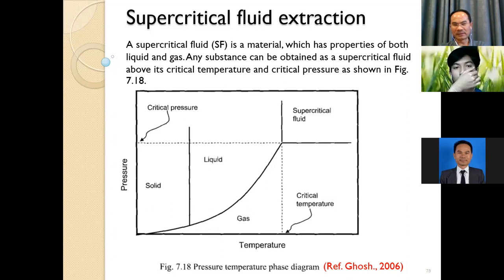And also the technique that I will talk about now is supercritical fluid extraction. This is the technique that is suitable for the bioproduct or biomolecule. First of all, what is a supercritical fluid? If we recall the knowledge that you studied in thermodynamics, that's right, in thermodynamics we draw the temperature and pressure diagram.